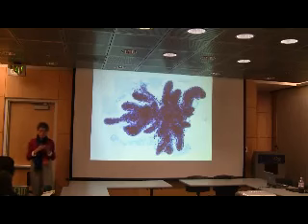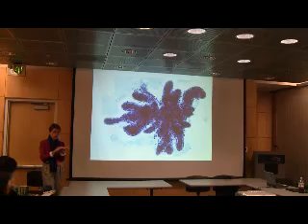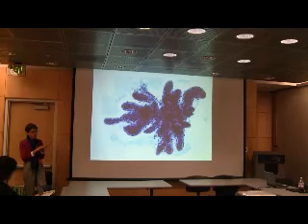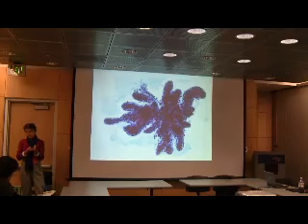But there's a shortcut. You can take the piece of tissue and put it into a cryomold. There's a medium called OCT. I'm not even sure anymore what it stands for. But you can use that instead of the paraffin, and you freeze it, and then you cut similarly thin slices from that frozen material and put it on a slide and stain it with H&E.